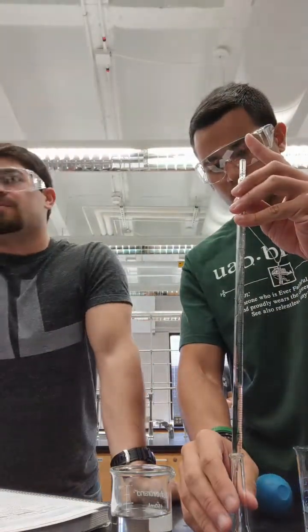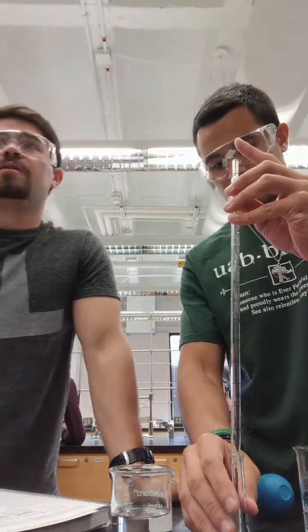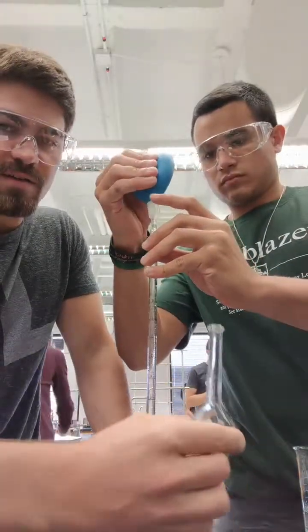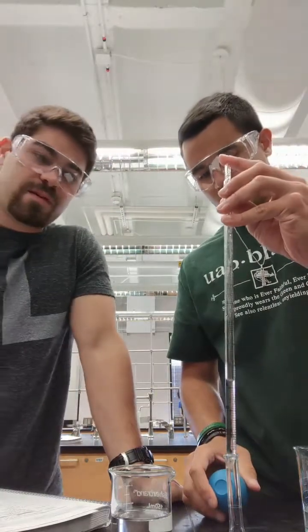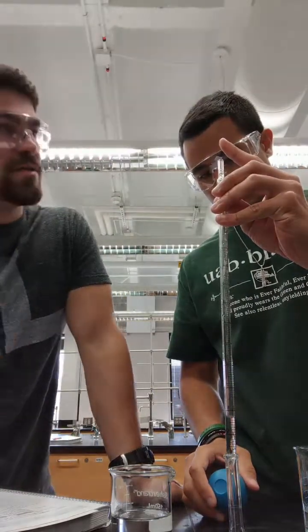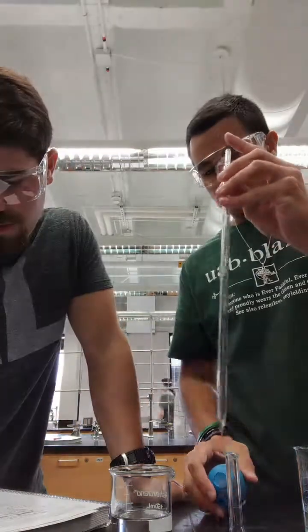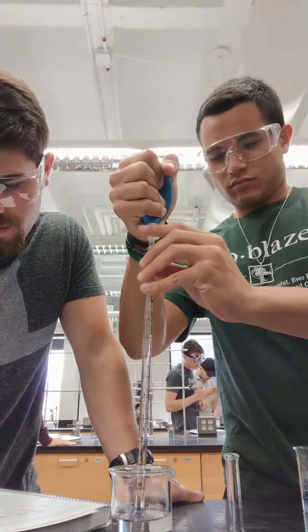dilution equation by V1, which is simply the amount that we put in here, and V2, which is always going to be 25 in the flask here. And the C1 is always 20% because that's the amount of stock solution that is pulled out of the main container and put into this beaker. And I believe just fill it until it gets, or put it.